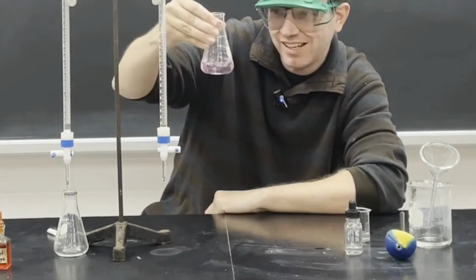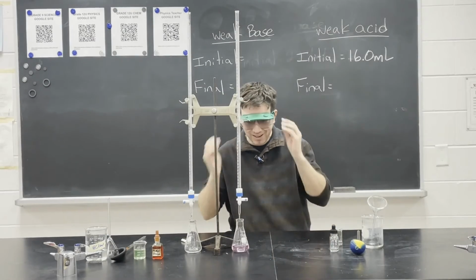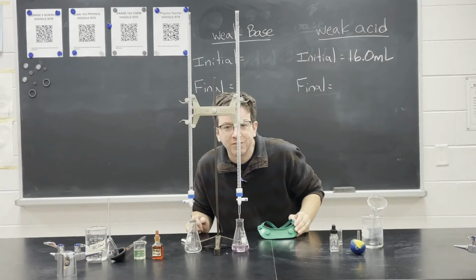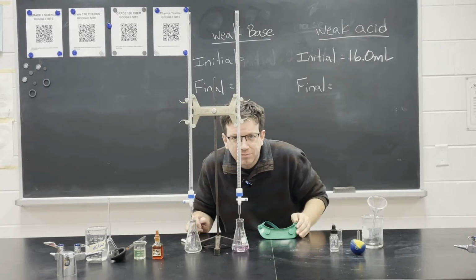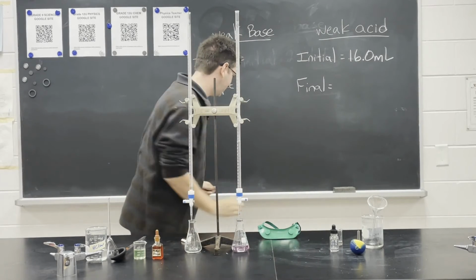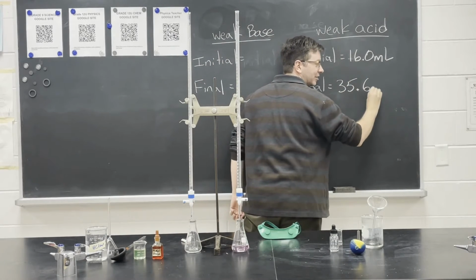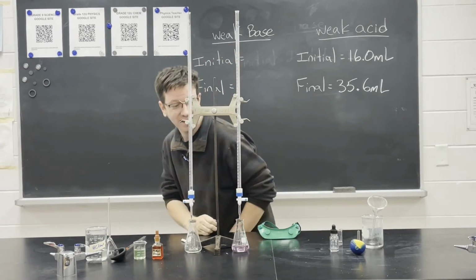And it's nice and sustained. So we are at a final volume of 35.6 milliliters. So that's all we need to know to be able to do our calculations.